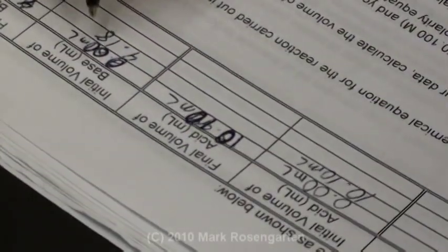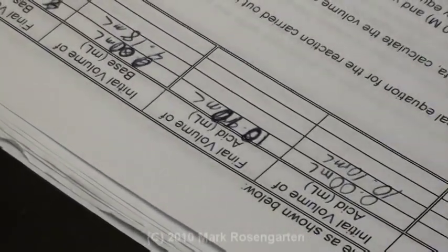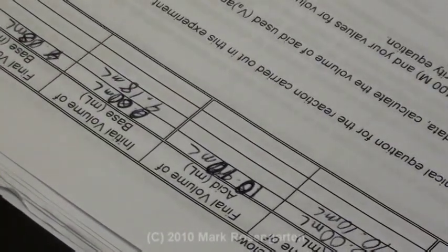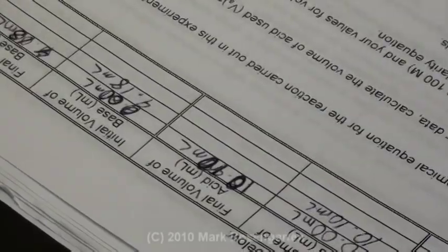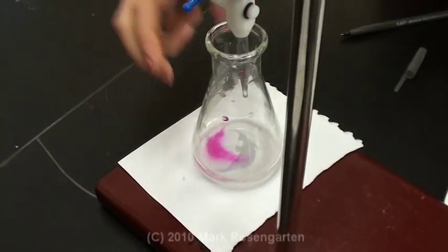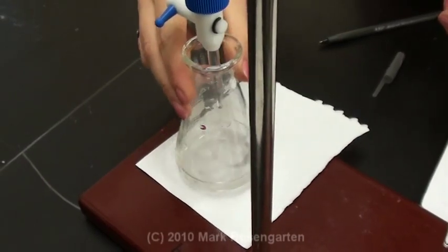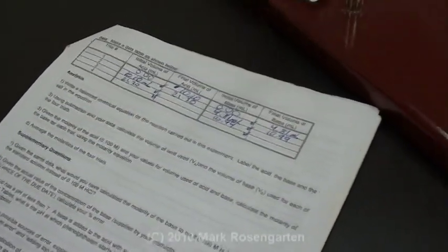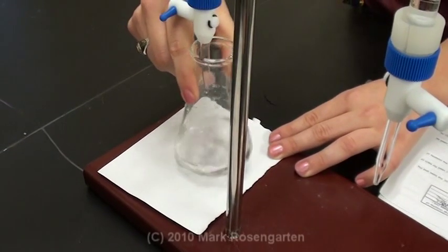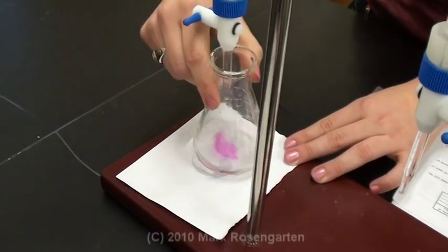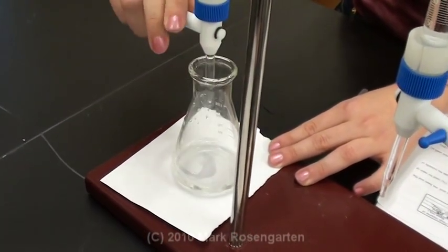So your final volume was 10.10 milliliters. You'll drain it out until it reads 20.10 milliliters. And then repeat the process until you have data for four trials, and the data gradually builds up. You'll find that as you do it more and more, your technique will continue to improve.